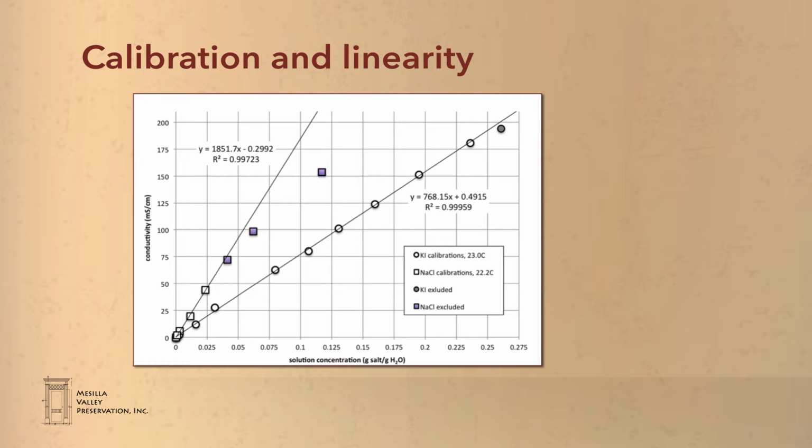The calibration curve is then built into software tools to apply to results. Of course, it is helpful to calibrate the conductivity meter with the actual salt you will be measuring in the field. For our testing, that salt has been sodium chloride.